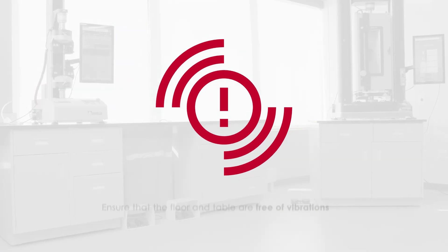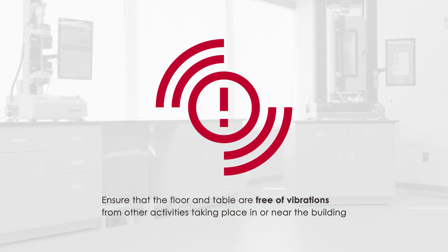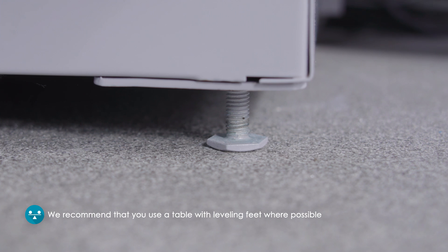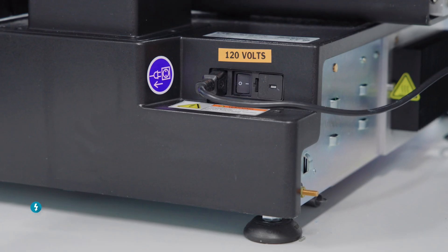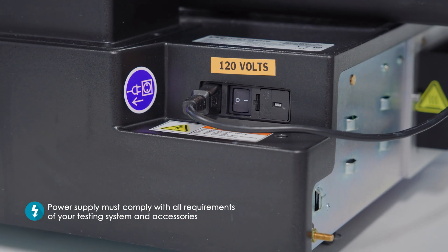It's also important to ensure that the floor and table are free of vibrations from other activities taking place in or near the building. We recommend that you use a table with leveling feet where possible. You'll also want to ensure the required power supply is available and that it complies with all requirements of your testing system and any accessories.